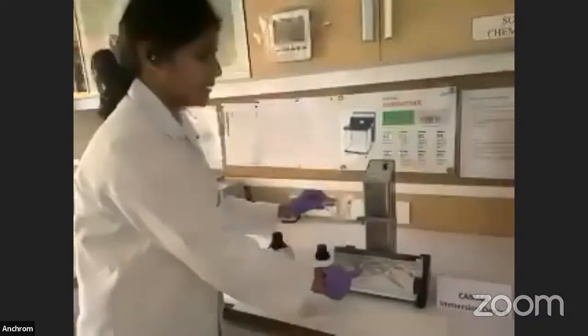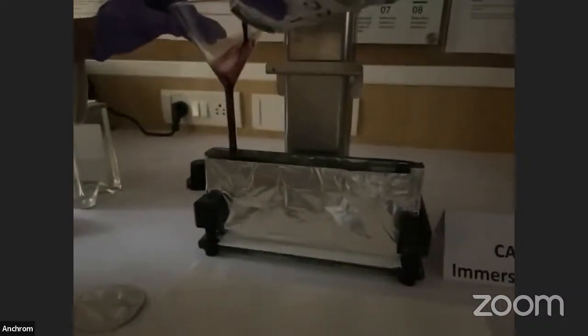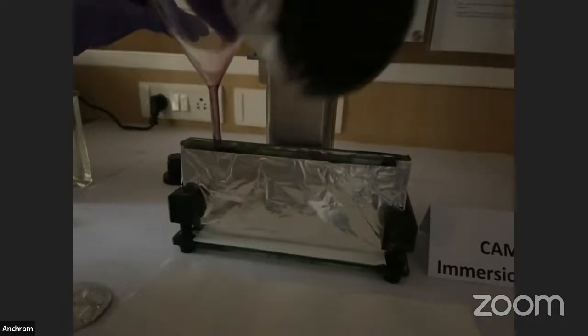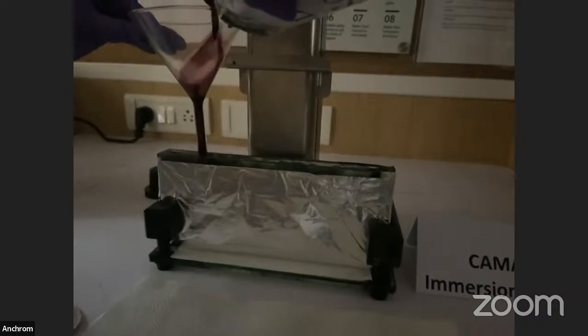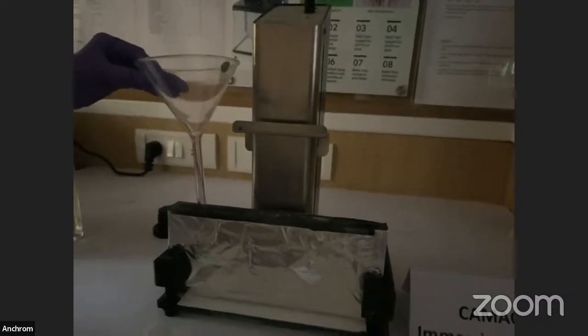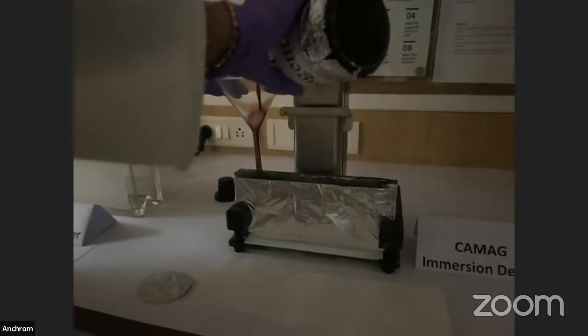Ensure that you have a clean funnel to transfer the reagent into the dipping tank. Ensure that you have at least 200 ml of DPPH reagent.